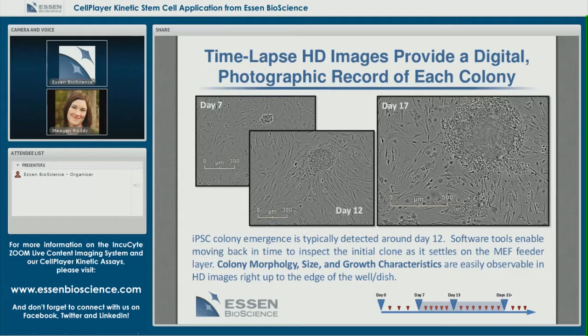Instead of removing vessels from the incubator and quickly inspecting them daily on the stereoscope, you can spend your time monitoring them in Zoom from your desk. You can export images — as I've done here — showing a particular colony on day 7, day 12, and day 17. You can also make a movie of colony development to share with others or to make a record of reprogramming.